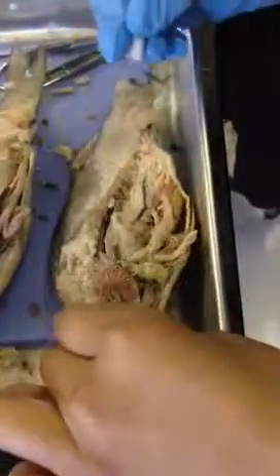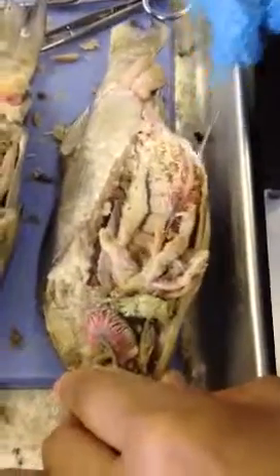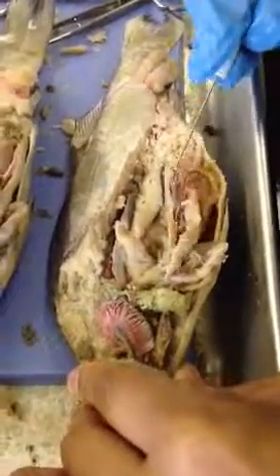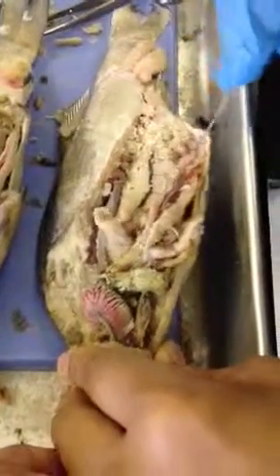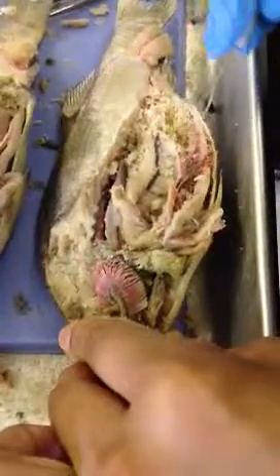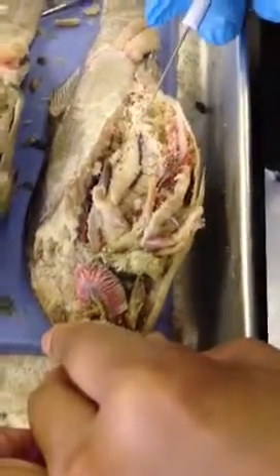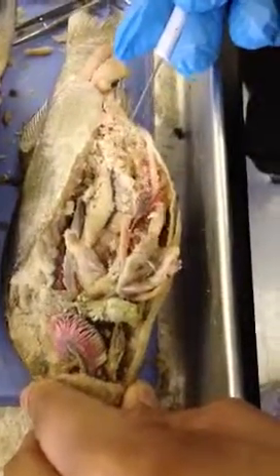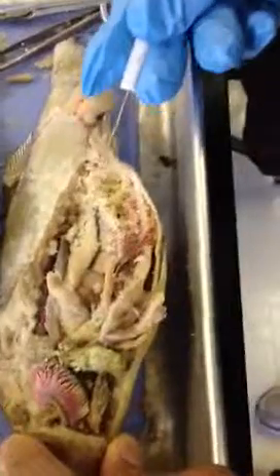Okay, I'll just touch it again. My professor said not to touch it, but I'm going to touch it. So what are these? The caudal mesenteric arteries right here. So after that, we go to here, and we get the ventral gonadal arteries that go into this ovary, the gonad.